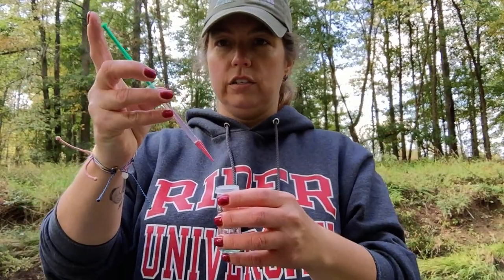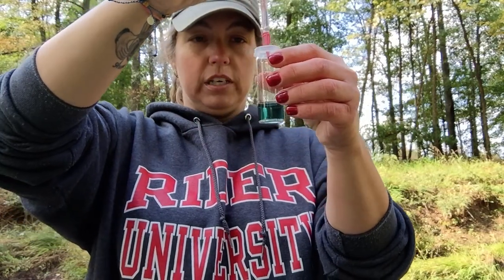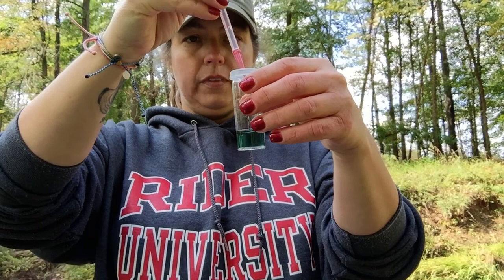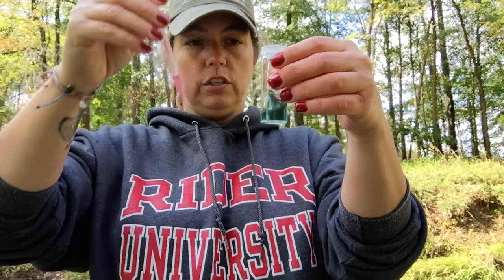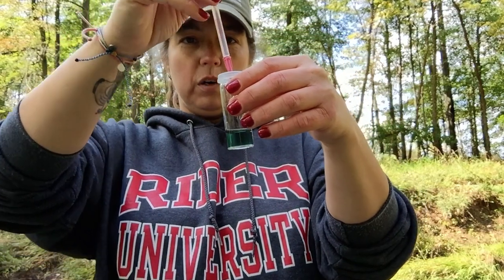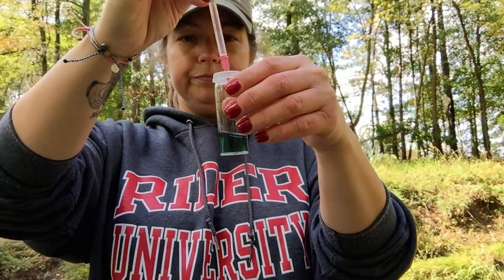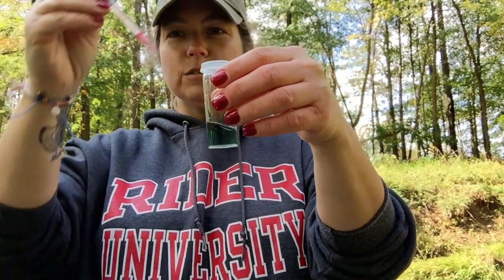I'm going to do it a couple drops at a time because I do not want to have to do this again. I'm being brave and doing two at once - did you see it? It changed color. I'm going one at a time now. It's flashing that purple - we're close.